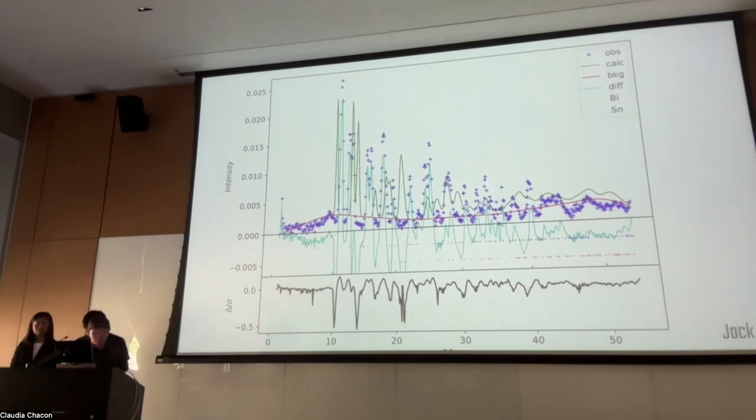To ensure proper phase stability, I had temporarily held the phase fraction constant while refining bismuth's A and C unit cell dimensions to align its reflection ticks directly with the raw data peaks. This targeted step securely anchored the bismuth phase, allowing the scale factors to refine cleanly. This resulted in a stabilized model with a final reduced chi-square score of 3.454. This confirms that we have correct structural phases, but also that the score reflects what we haven't fully resolved.